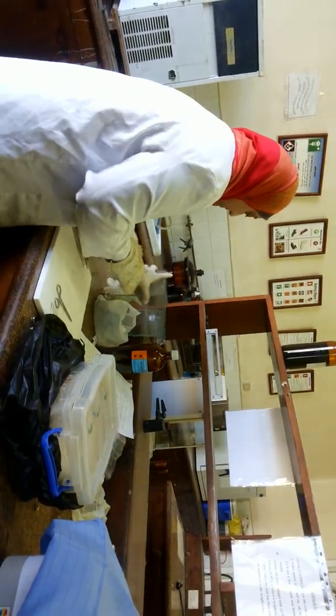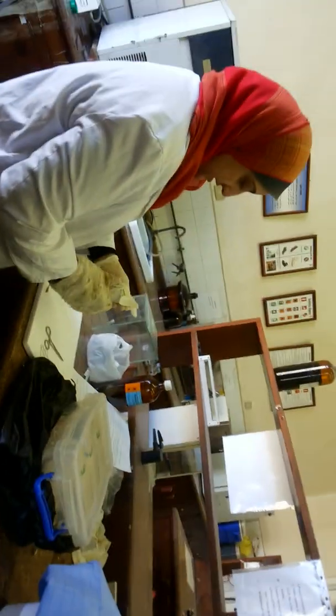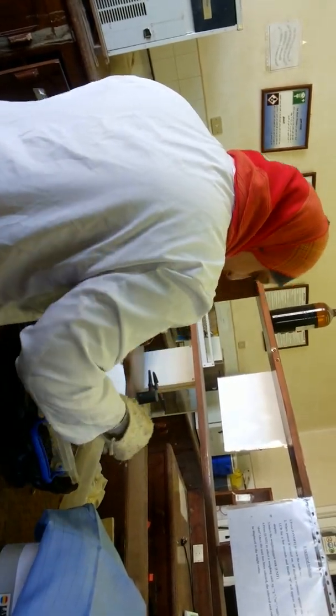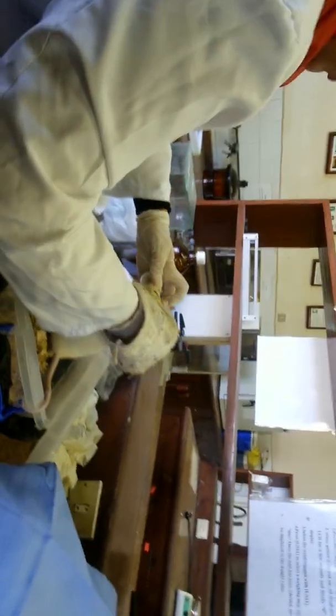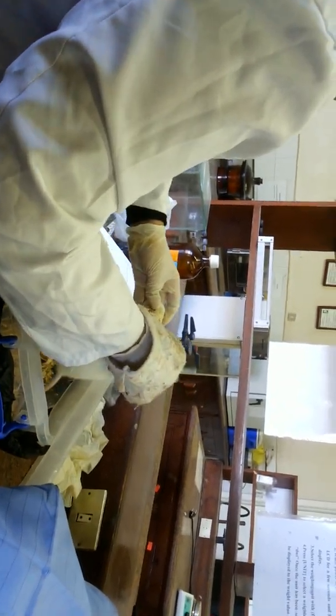Okay, here we are going to go to the bottom container. It is saturated with diethyl ether and I am going to place my little rat inside. She is a little bit skinny. The most suitable way to handle the rat is from the back of her neck. I am going to let her inhale the diethyl ether.